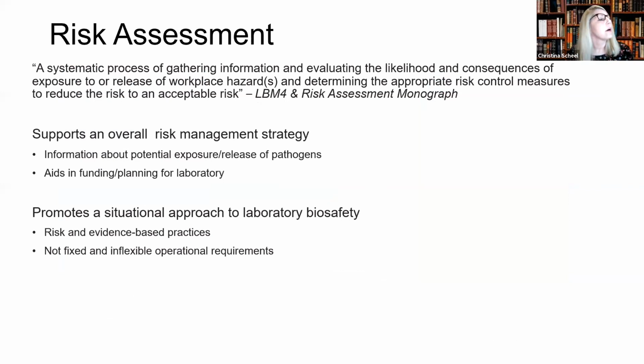So what is a risk assessment? There is a definition that I pulled directly from the LBM-4, and the poll just came up already. Okay, this is directly from the LBM-4 and the risk assessment monograph. It is a systematic process of gathering information and evaluating the likelihood and consequences of exposure to or release of workplace hazards, and determining the appropriate risk control measures to reduce risk to an acceptable level.